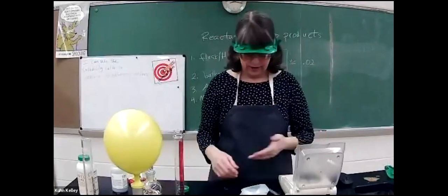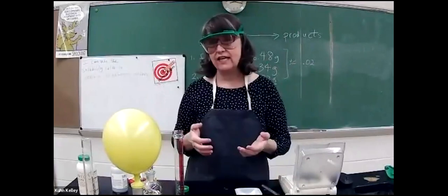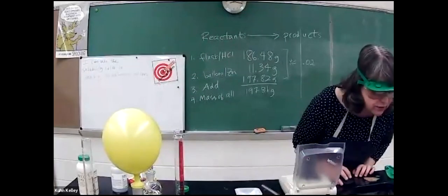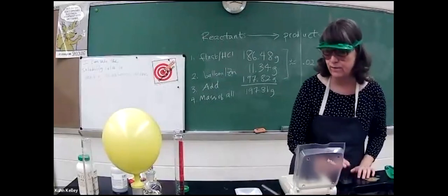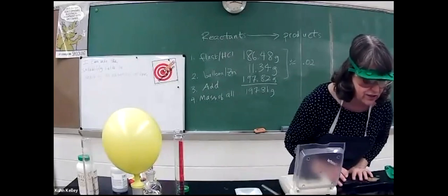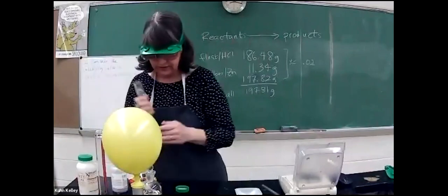In the second part, I'm basically doing the same thing, except instead of using hydrochloric acid and zinc, I'm using acetic acid and sodium bicarbonate. So going down to procedure part 2, we're going to come back and get number 5 for that first data table. Don't forget you want to write observations of what's happened to the right of that data table where it says changes observed. In part 2, my first step is to get 50 mils of acetic acid.